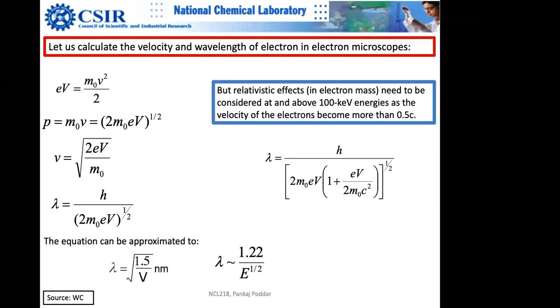Fine, so now we can use de Broglie's principle for our application in electron microscopy. How can we use it? You can see on the screen the accelerating voltage V, and this is the velocity of the electron v, and now I can calculate, finally, the lambda associated with that. Why do I need lambda? I'll come to that in a minute.